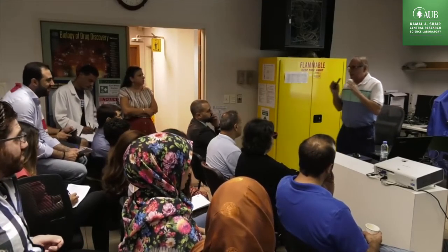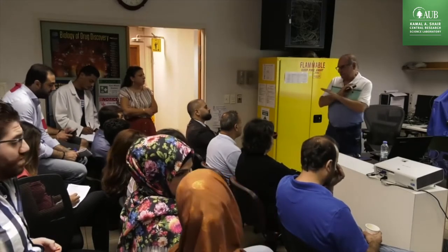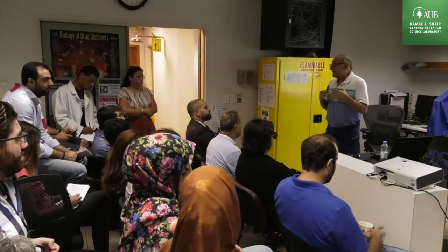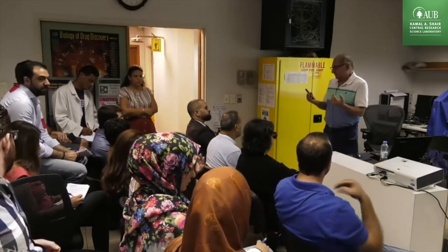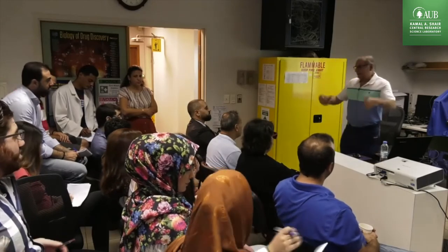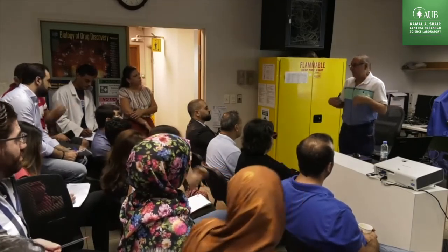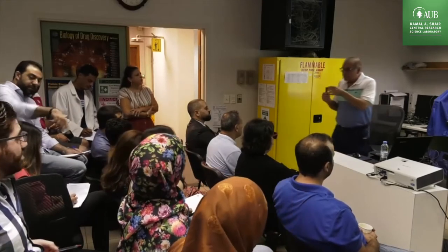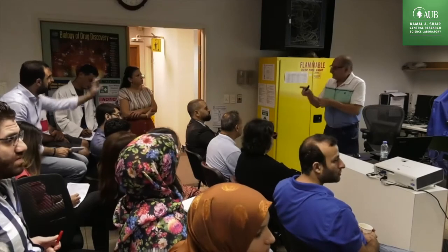Okay? Remember, as I said yesterday, if you have the active species on the external surface, it's going to die in 5 minutes because it has no surface. It's only maybe one or maybe half a square meter per gram. The internal is the most important thing. So all the active species have to go inside the pore where we have the area. And this pore, this is why we measure the texture of the support, should be accessible for the reactant.